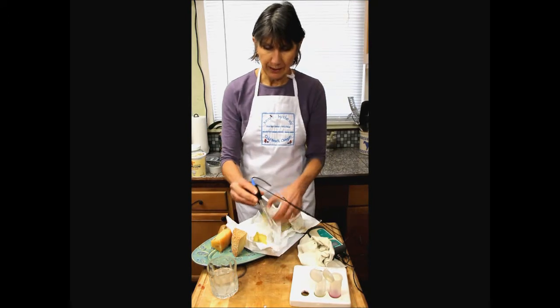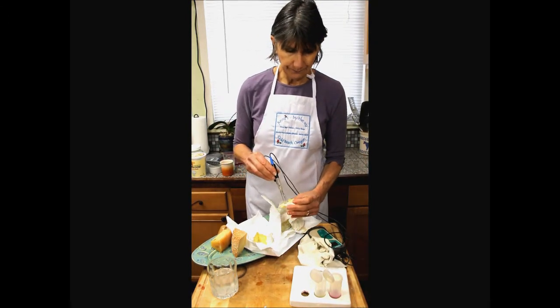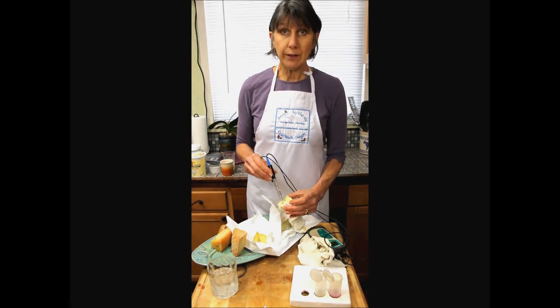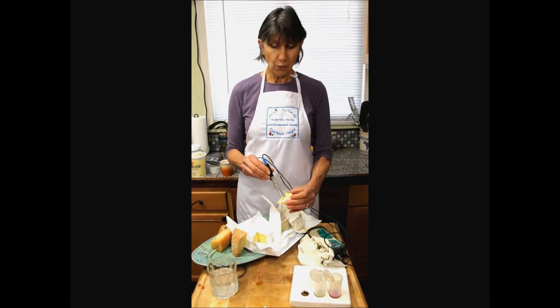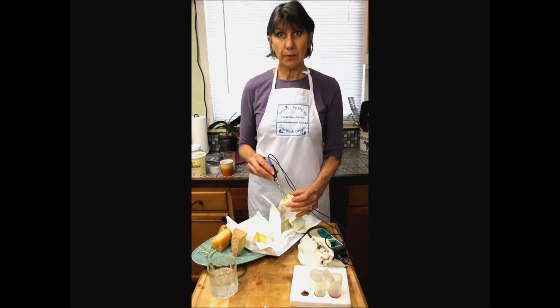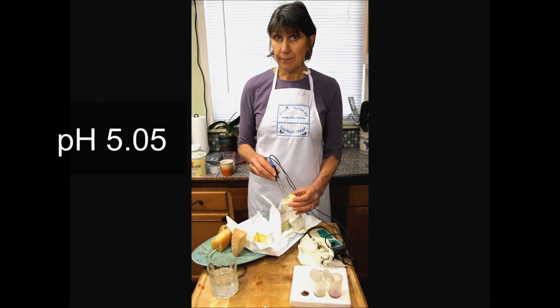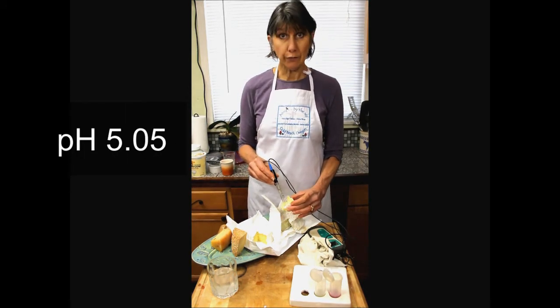And let's check the paste on this young Camembert style cheese. As with the milk, a temperature difference is going to make a pH difference. So just know that when you're checking your curd. So this is reading 5.05. I'm not surprised. It is still firm.